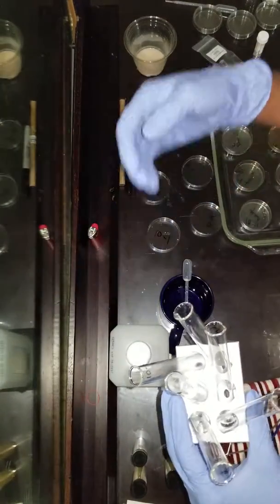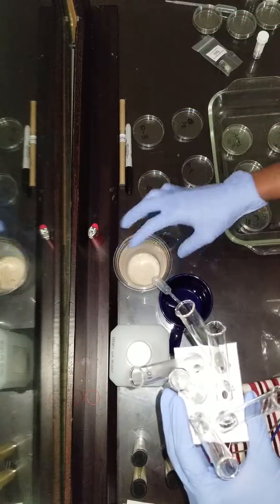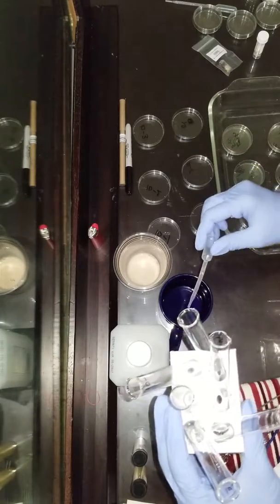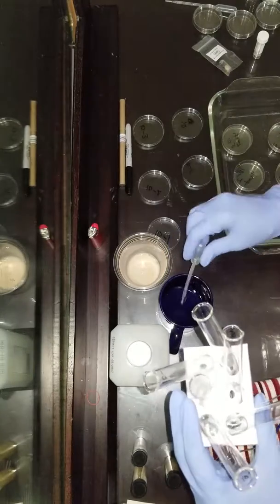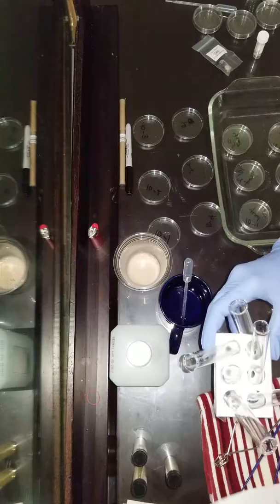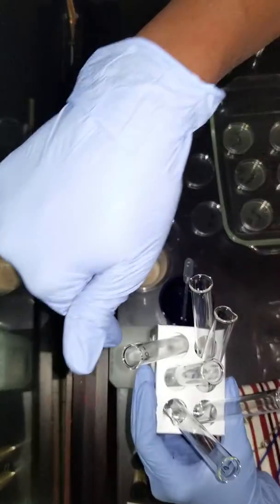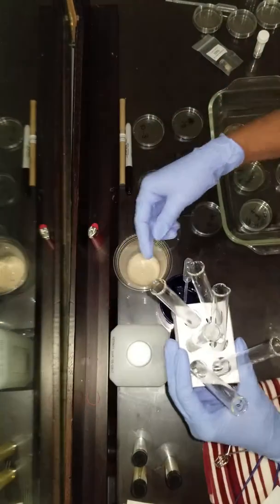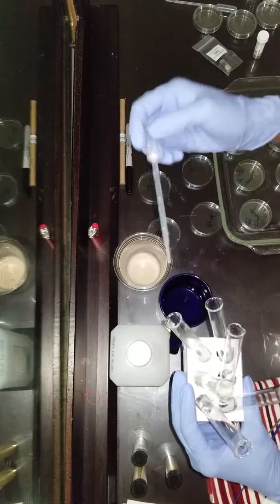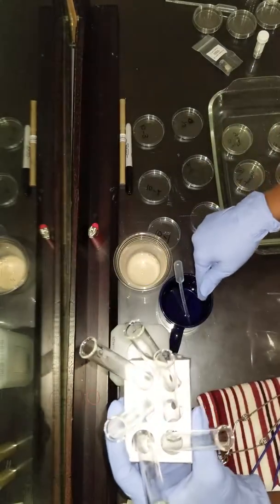And then I pipetted from the yeast solution, making sure to clean the pipette between each procedure. I pipetted 0.25 milliliters of the yeast into 10^-1. Then I cleaned the pipette. Then from 10^-1, I pipetted 0.25 to 10^-2. Then I cleaned the pipette.